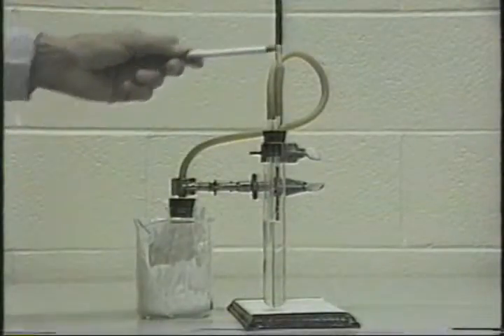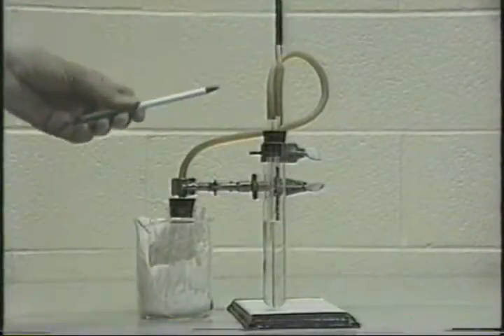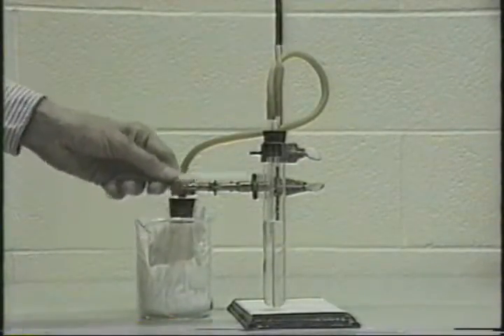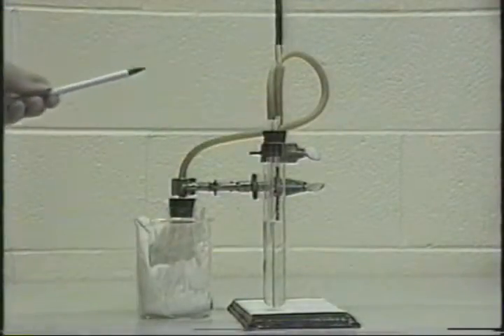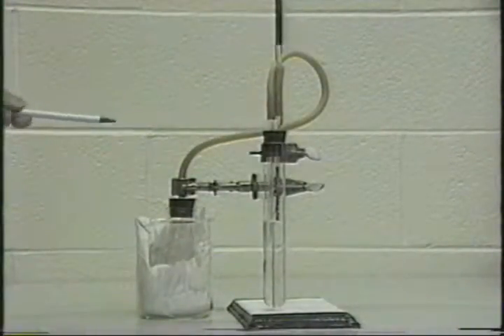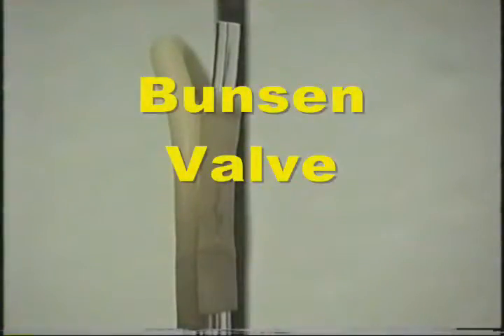That slit must be pointing away from you in some direction where it's not going to be pointing at anybody, because in case some of the solution should, for some reason or another, bubble up and spurt out there, you don't want that to go into anybody's face. Let's take a closer look at that Bunsen valve now. Here's the Bunsen valve in close-up.